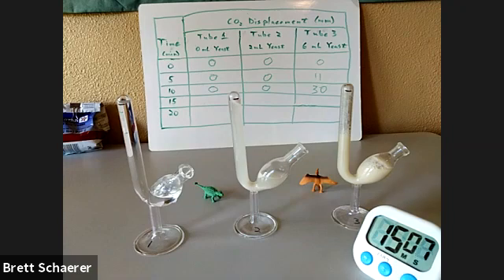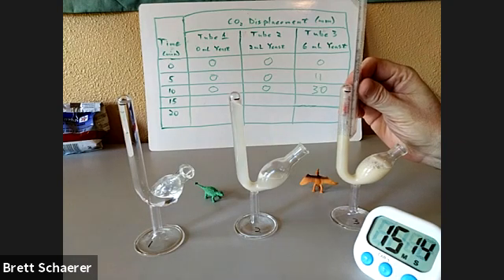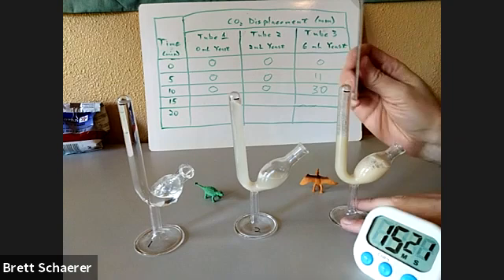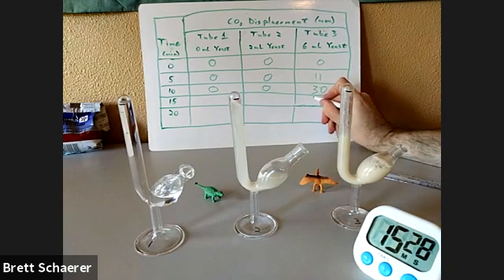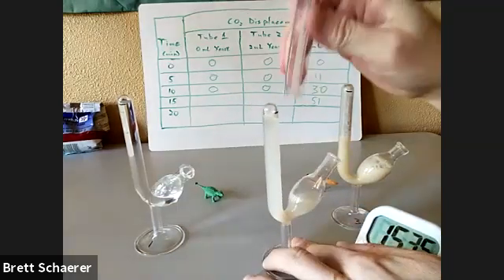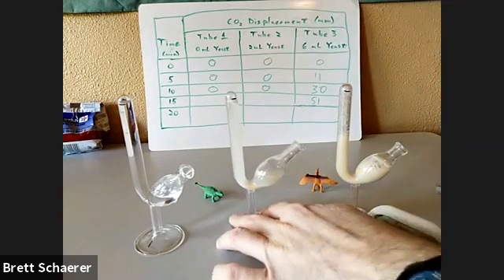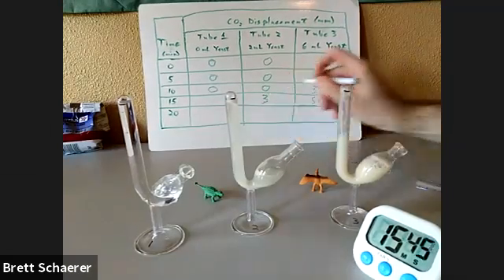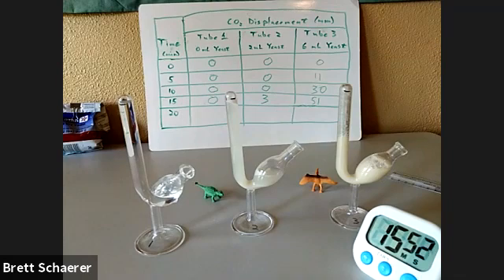We are at 15 minutes now, so we'll do another measurement. That looks like 51 millimeters for tube three. Looks like tube two is finally getting going — looks like about three millimeters. And tube one is still at zero. I'll pause this again and take one more reading.